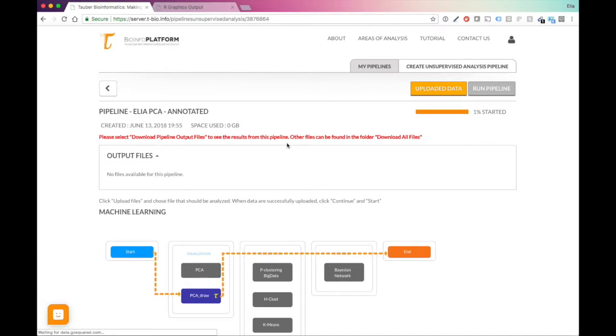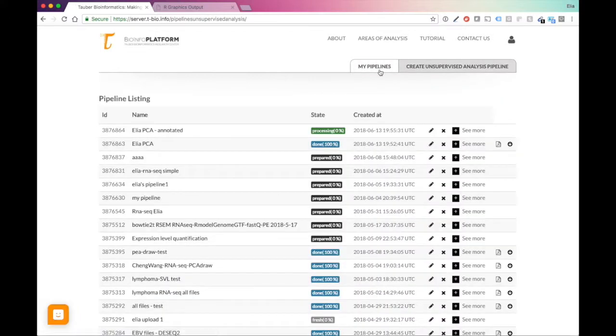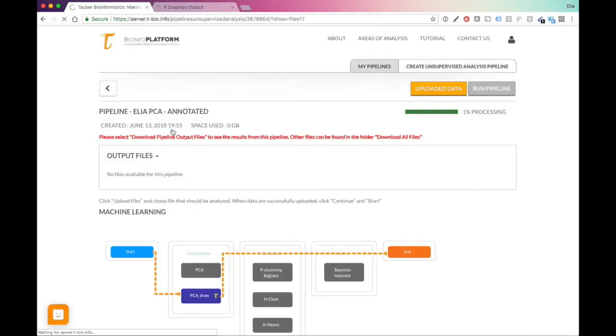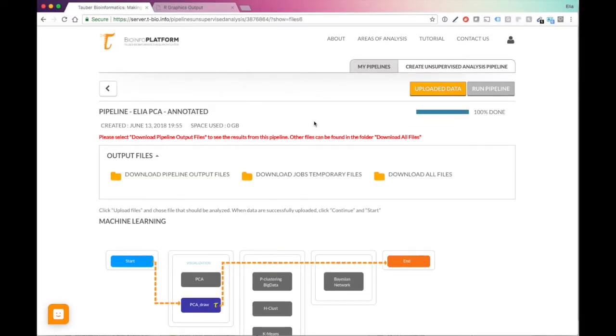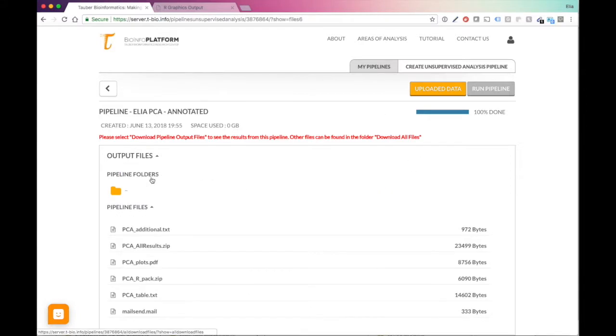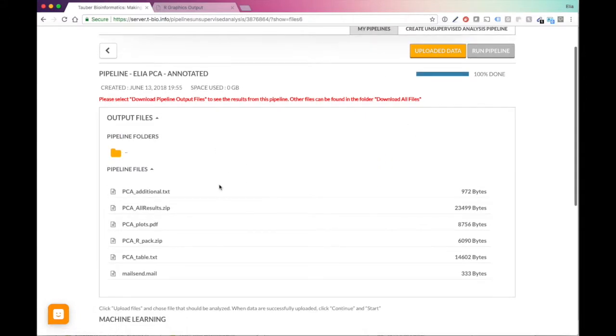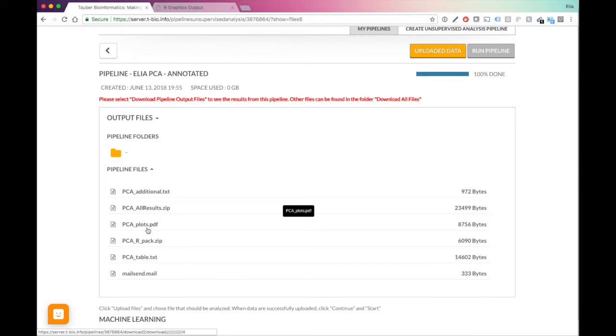What I want to see now is how the annotation will come up on the plot. Now you can see, again, it started. Let me go back to my pipelines. We open this. Let's just give it a moment. So now you can see that my pipeline has finished. Let's go to download output files. And now let's go to PCA plots.